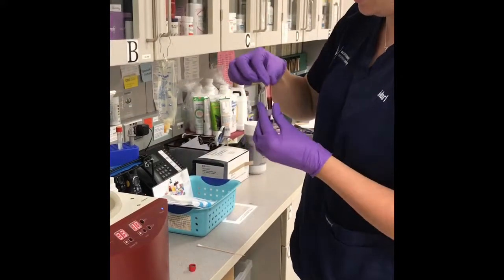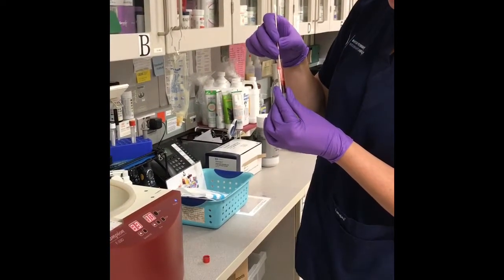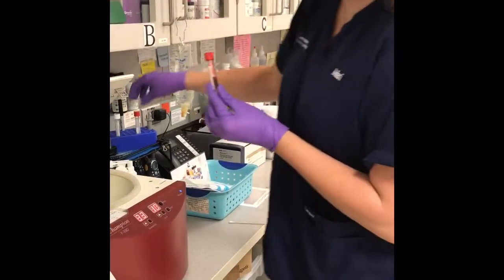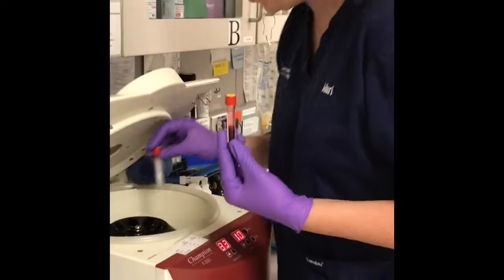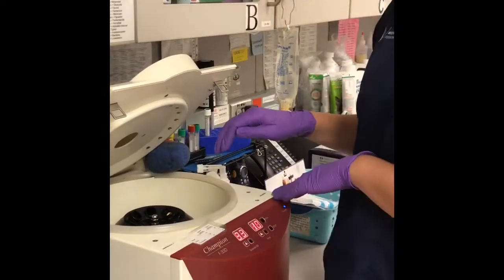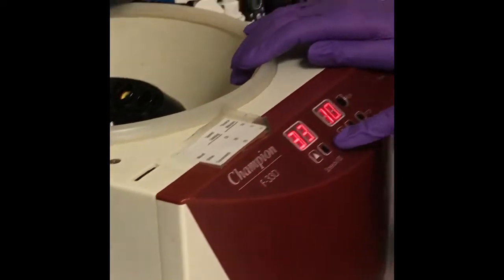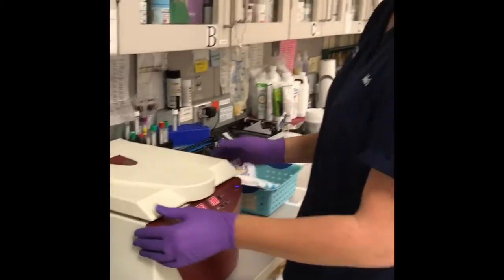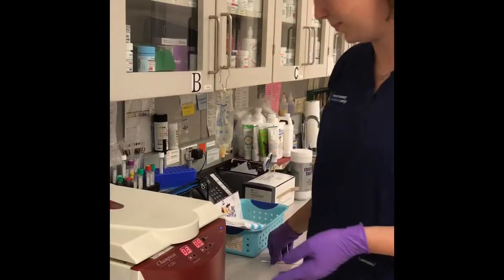So I'll open it up, rim it with the end of our cotton tip applicator just to make sure the clot is broken from the edge. Close the tube, get our balancer tube, which once again, you can see they're about the same amount. I'm going to place these in number 5 and number 1. Our manufacturer settings for this particular centrifuge are going to spin our blood at 3,300 RPMs for 10 minutes. Go ahead and close that, hit run, and we'll be back in 10 minutes once our blood is finished spinning.